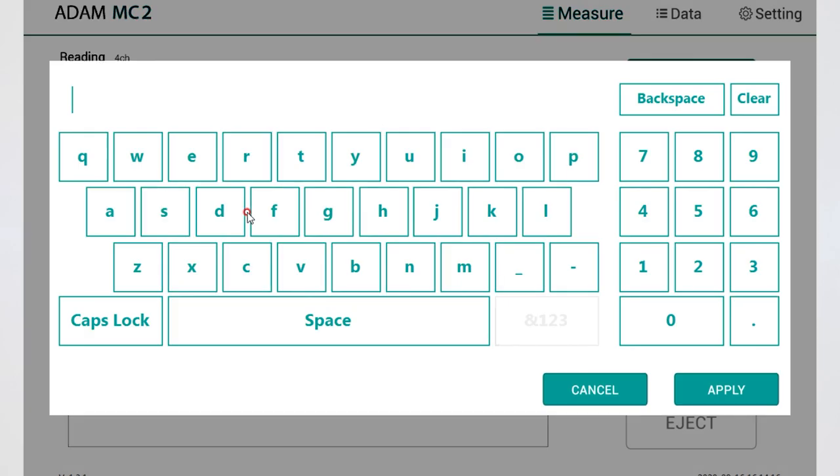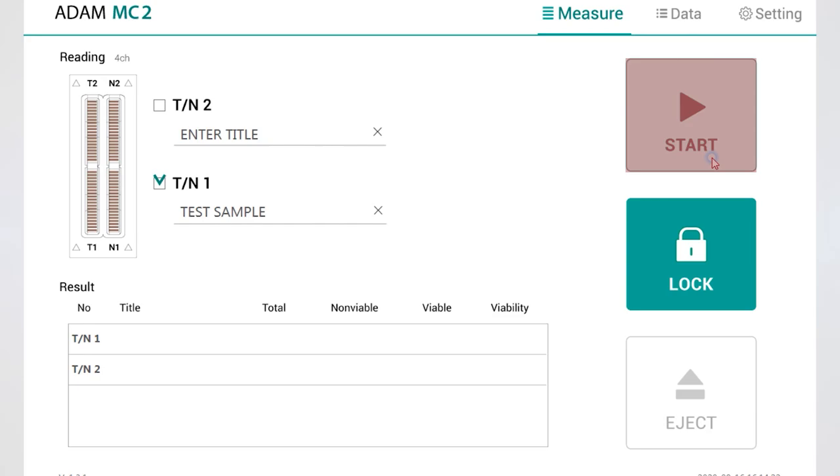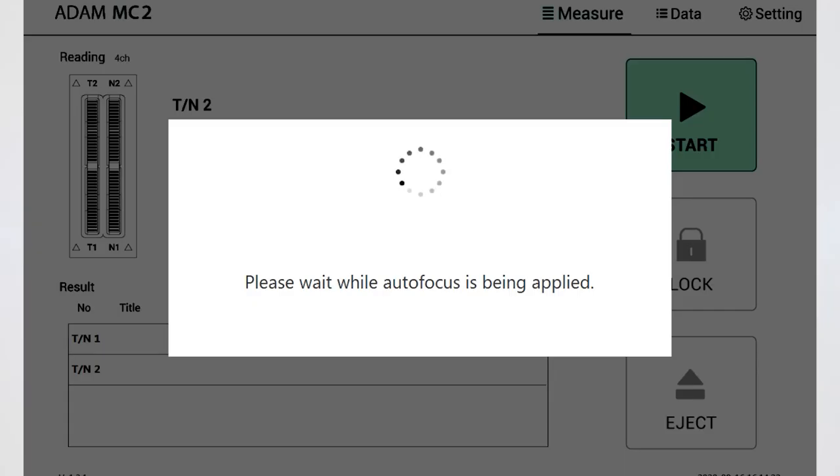On the measure tab, you can enter the test title. Initial tests may take about 2 minutes longer due to autofocus.